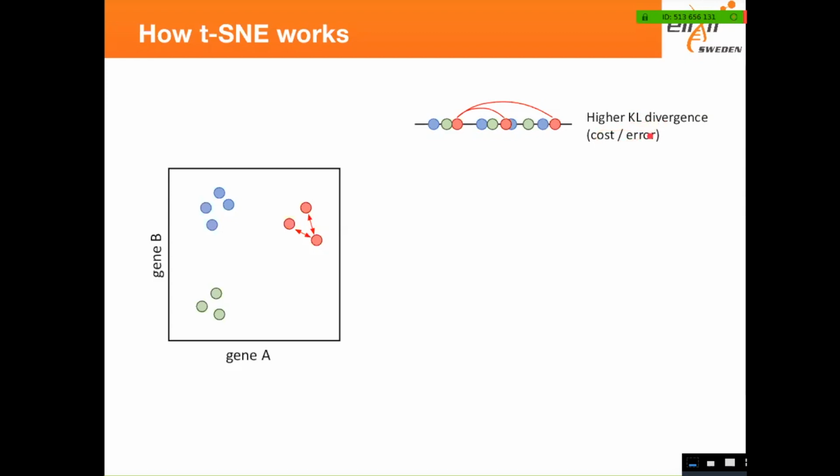So it has a higher error in your representation. So that makes sense that some of those cells we actually need to push them together in here, so that those 3 cells become quite closer together as in the original space. So that gives a weight to these cells to move apart from where they are and move together.